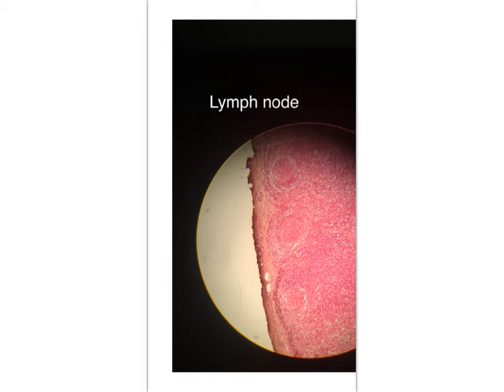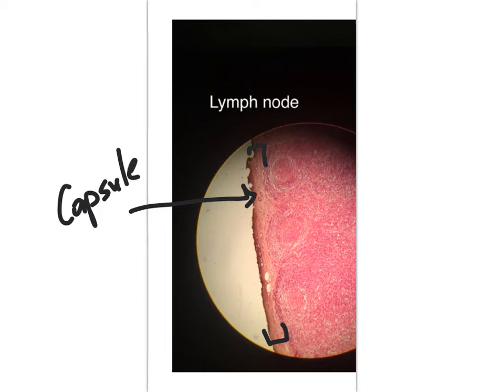The second slide we want to be familiar with is the lymph node, and there are 3 portions associated with the lymph node. That is our capsule, the cortex, and the medulla. What you'll see, and as I mentioned in lab, what I always think about is this layer here that reminds me of a layer of uncooked bacon. Okay, so this strip right there, running all the way between, this would be our capsule. The capsule represents the outer covering of our lymph node.